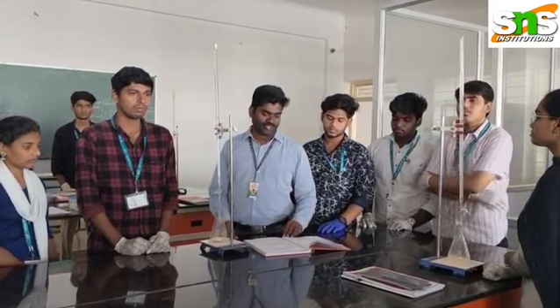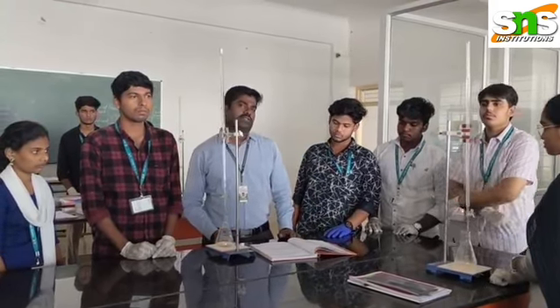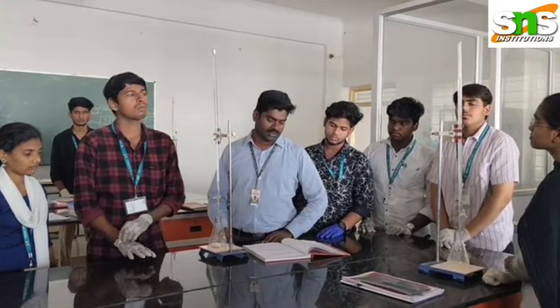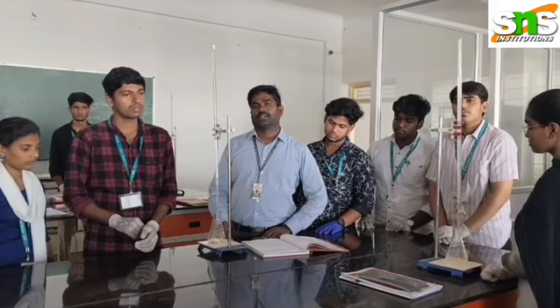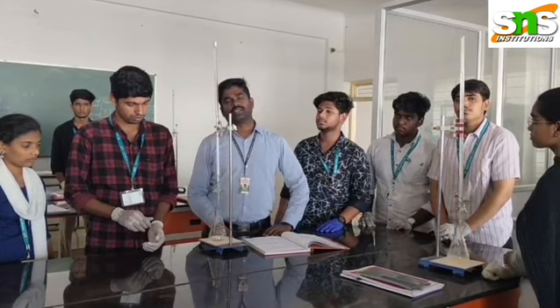So we are taking 2.75 ml of concentrated sulfuric acid dissolved in 1 liter of distilled water. The strength is 0.1 N sulfuric acid.